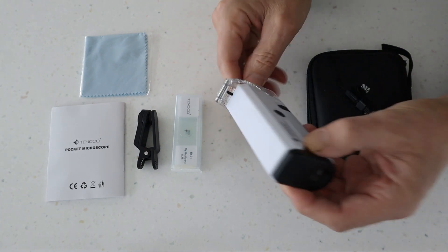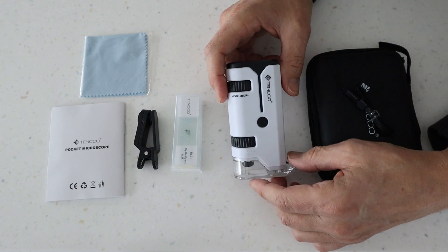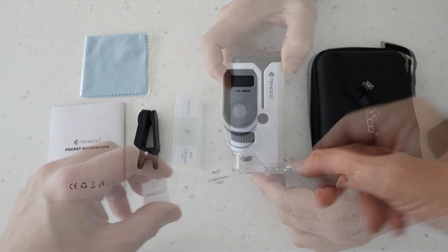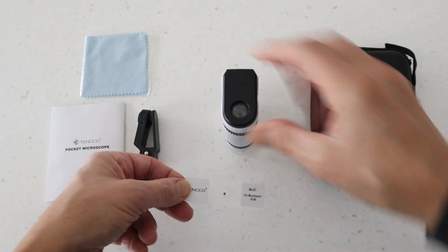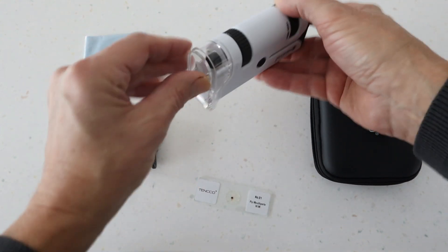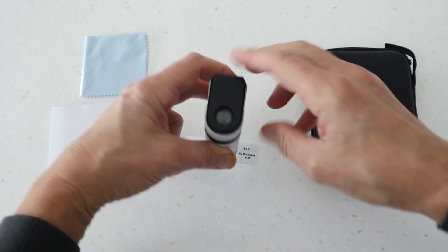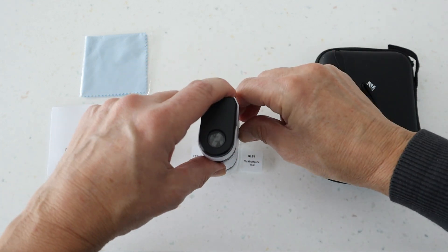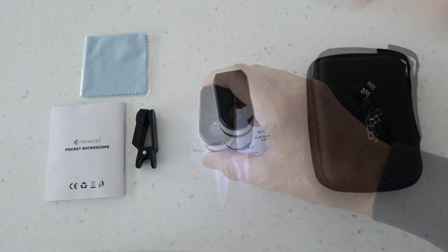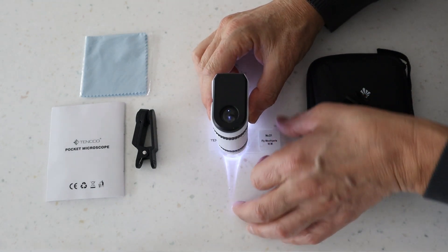That's pretty much it in terms of the microscope itself. What I'm going to do now is put a slide in and take a look to see how well it works, then attach my phone and see what kind of picture we get. To use the microscope with a slide, you make sure the plastic cap is down and around, then you take your slide and slide it between the base, get it in position, turn your light on, and then view it down through the viewing lens. I've just viewed the first slide here — it says fly mouth parts.